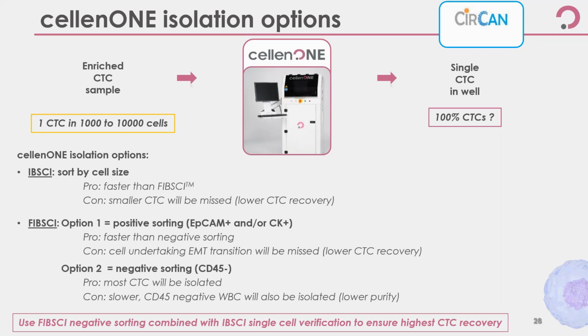And the main risk of this option came from the fact that maybe not all the white blood cells would be labeled with CD45.